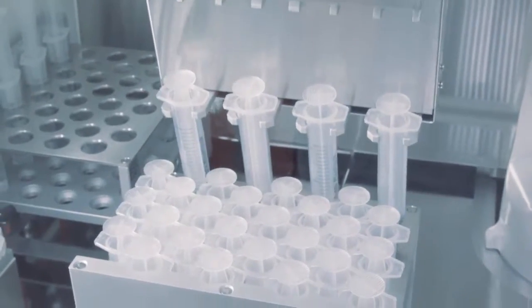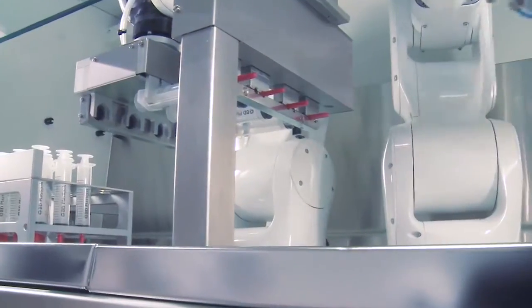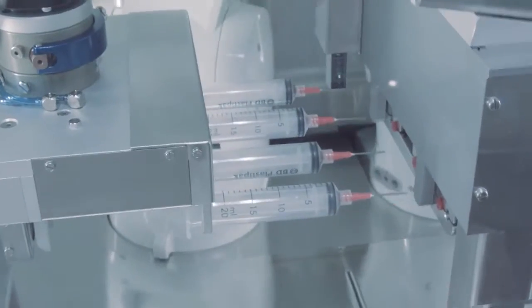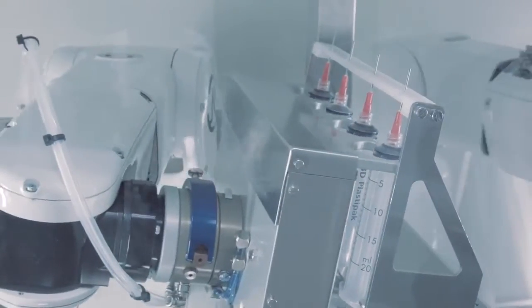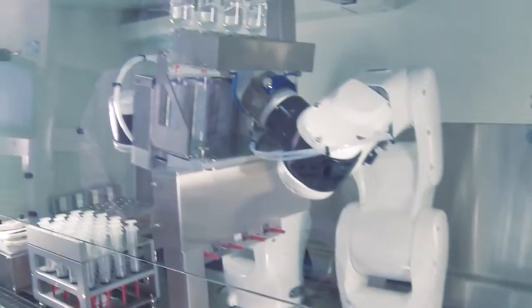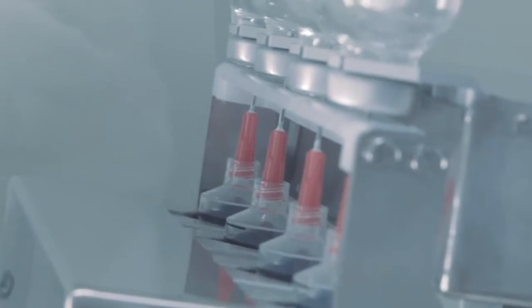Another robot grabs the syringes and removes the needle caps. The robot inserts the needles into the dose vials and the medicinal substance is drawn into the syringe.